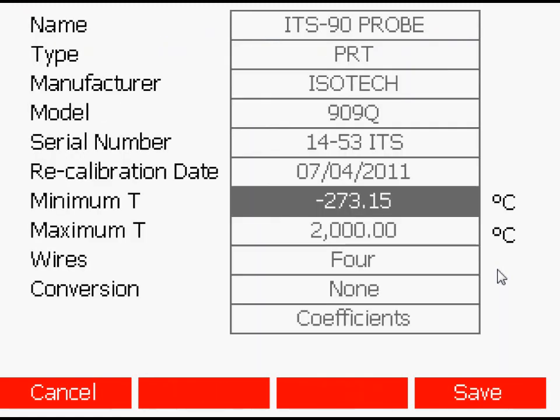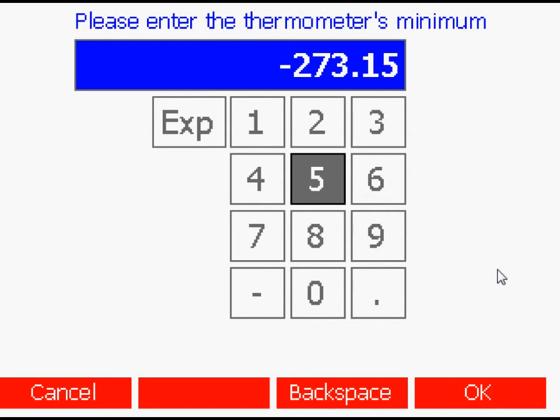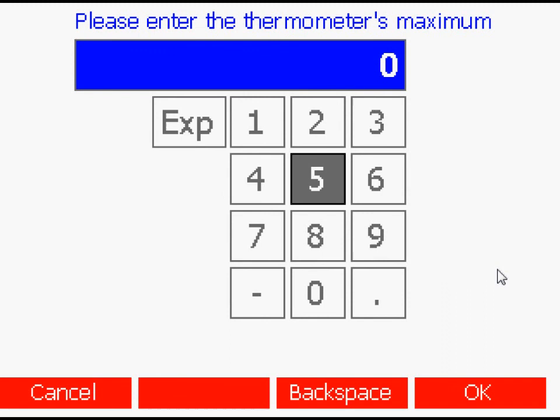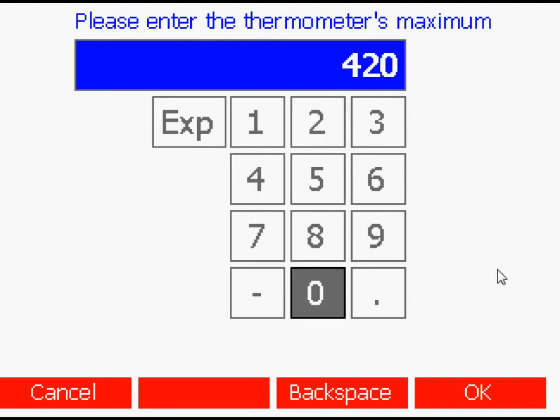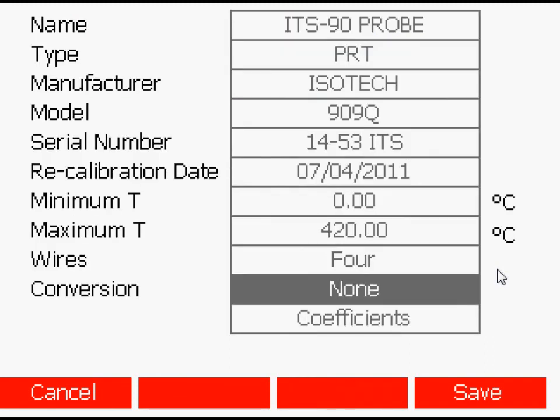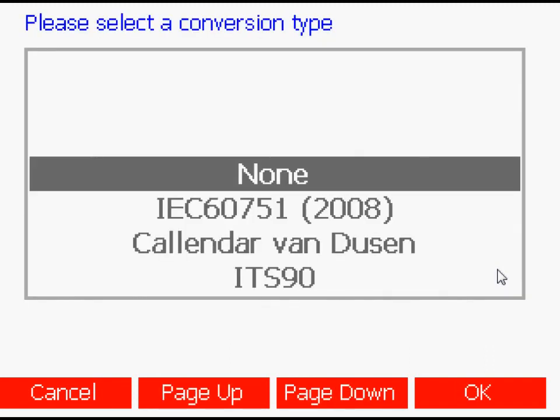The minimum operating temperature for the probe, the maximum operating temperature for the probe, the number of wires in the probe.